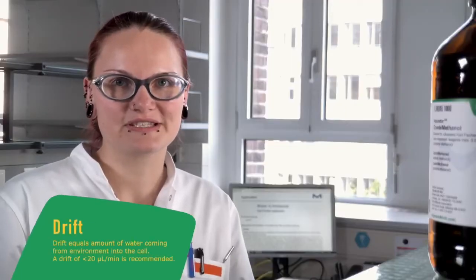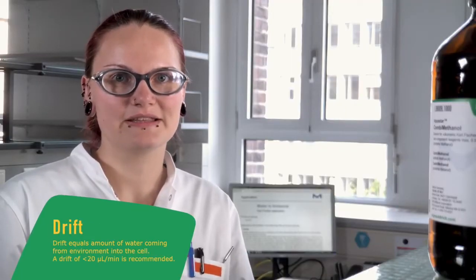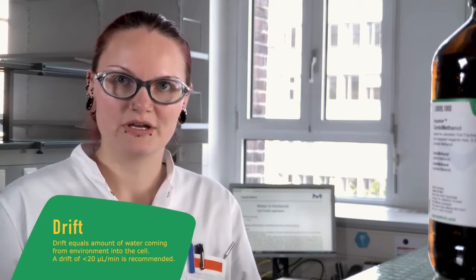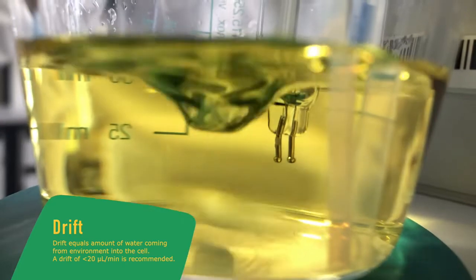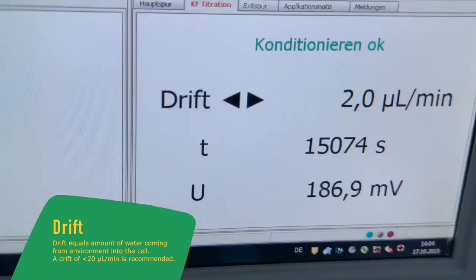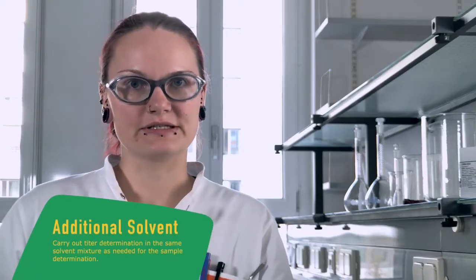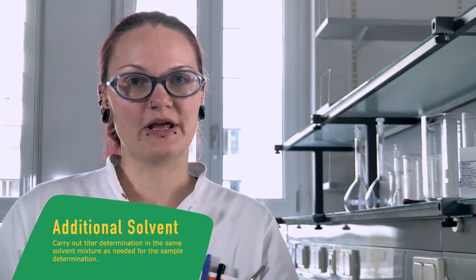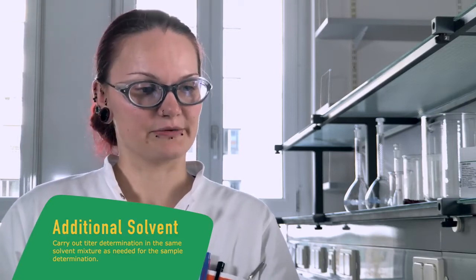The titration cell is never really tight, that's why we have a drift. And the drift shows us the amount of water which comes from the environment into our titration cell. The drift should be below 20 microliter per minute and stable. If additional solvent is needed for a sample, make sure to perform the Titer determination in the solvent mixture.